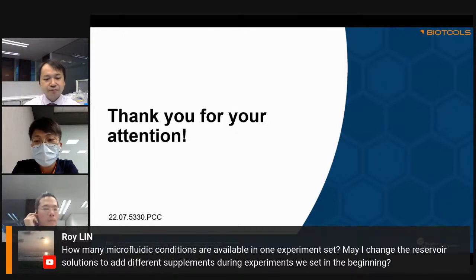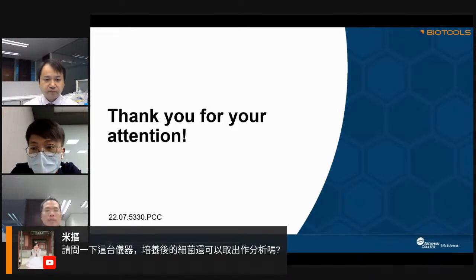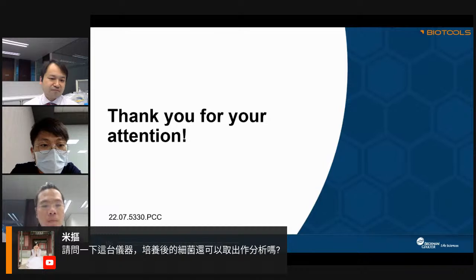Okay, there are lots of questions, and our client has another question: can we take the cultured bacteria out to do further analysis? Is that possible? Well, we are just doing the fermentation inside the instrument, so most likely the answer is yes. But maybe you can add some more information for that.